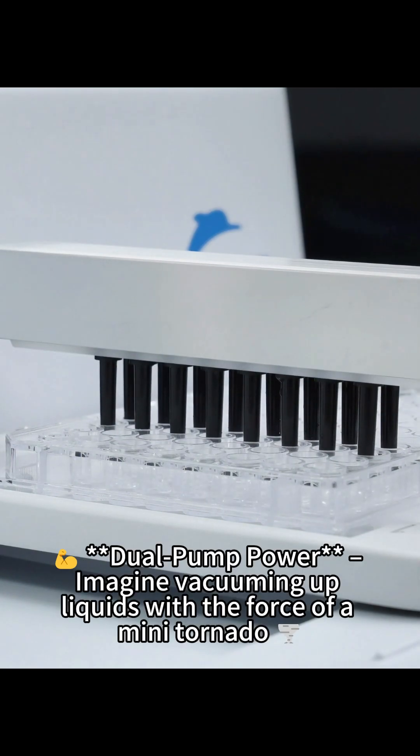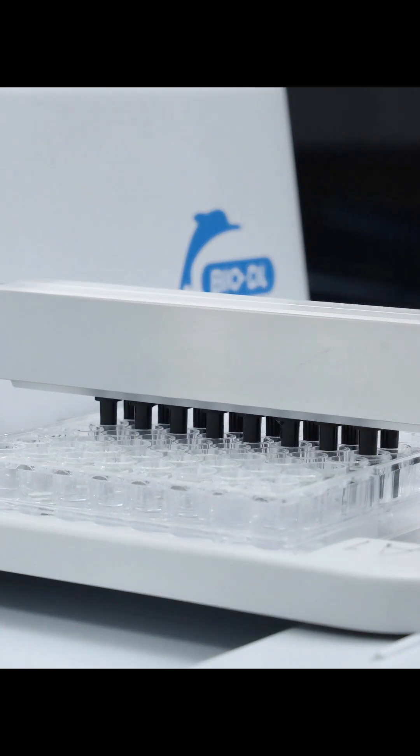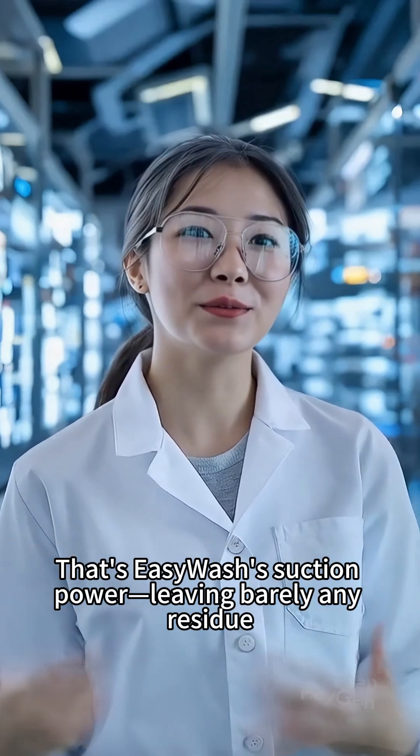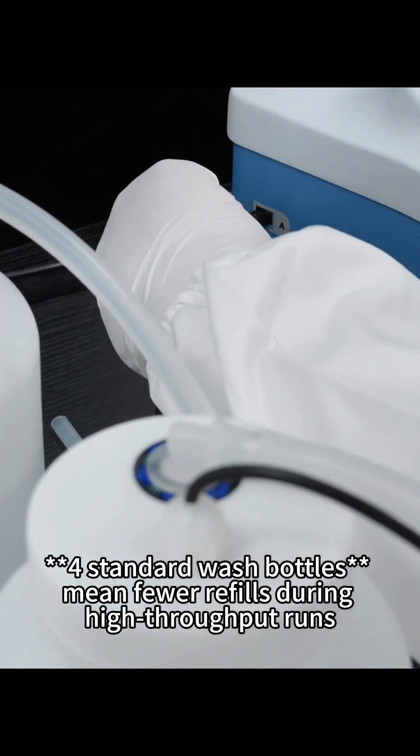Dual pump power. Imagine vacuuming up liquids with the force of a mini tornado — that's EasyWash's suction power, leaving barely any residue. Plus, four standard wash bottles mean fewer refills during high-throughput runs.